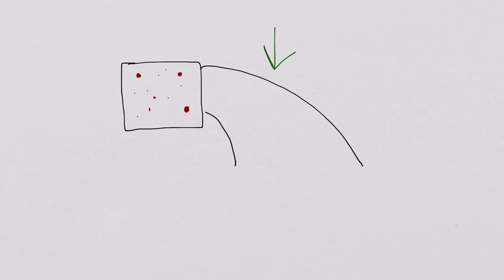So if we are talking about one of these large particles coming out of this system, this force that I'm representing here is going to push on that particle, but the particle is so massive that the force doesn't really have a huge effect, and that particle is going to change its course by a little bit, but because the particle is so massive, the force really doesn't affect its trajectory too much, at least not relative to other particles. So let's imagine that heavier particle would have crashed maybe somewhere over here.